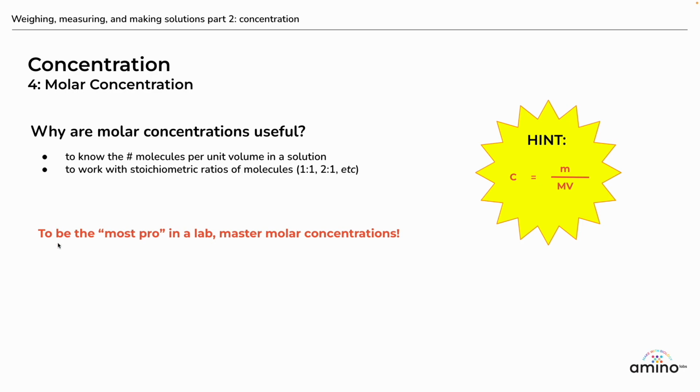If you're a pro in the lab, you definitely know molar concentrations. They come up almost every day in the lab, so understanding molar concentrations is important.